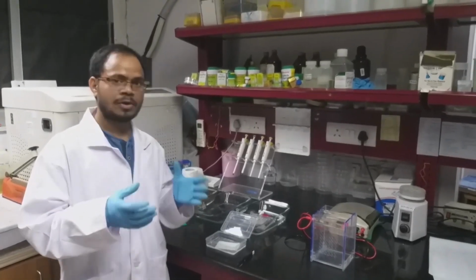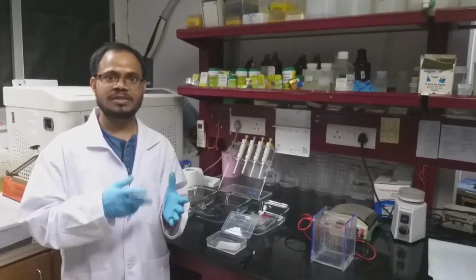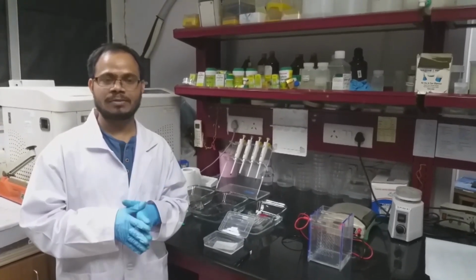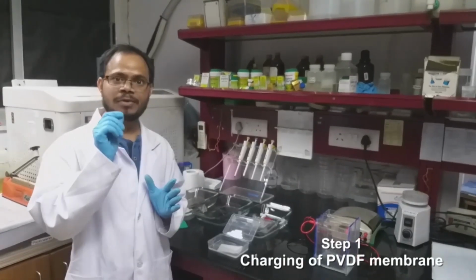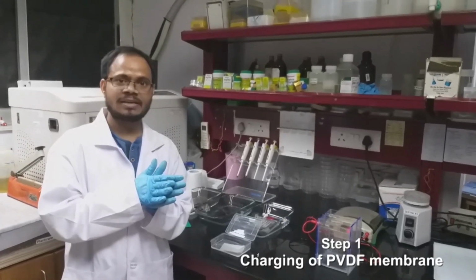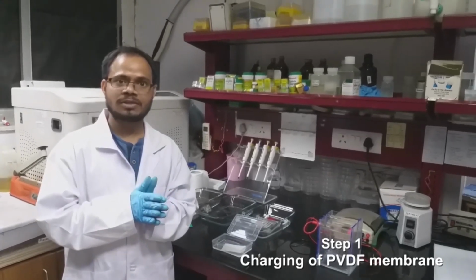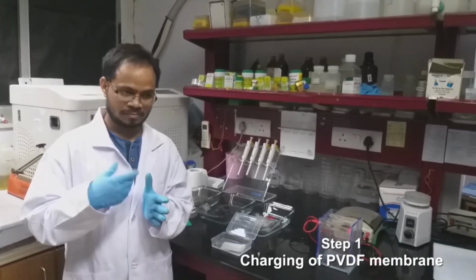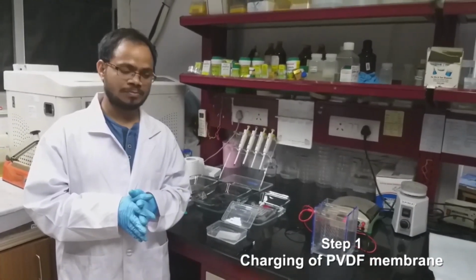If you are taking from a bundle, you have to cut precisely for how many wells you want. After that, you have to label the front of the blot, where the front side is used for transferring the protein, and it is also used in further steps, like antibody incubation.